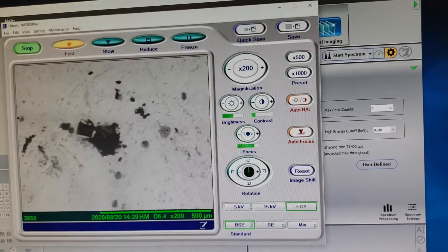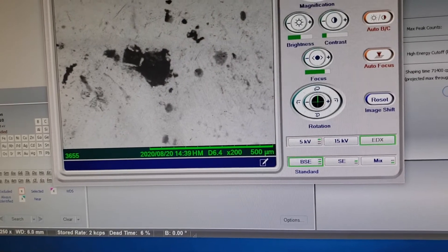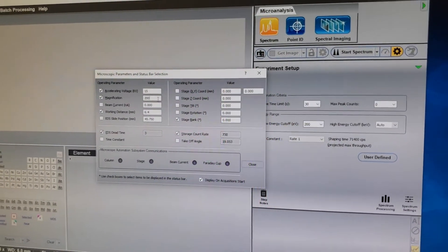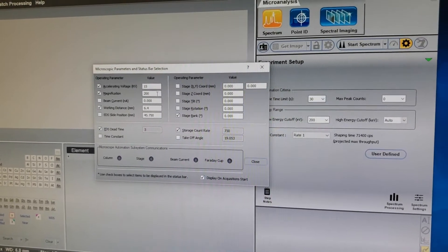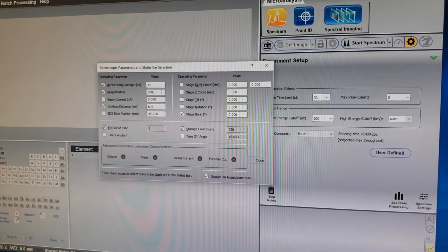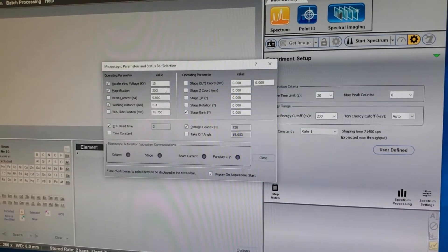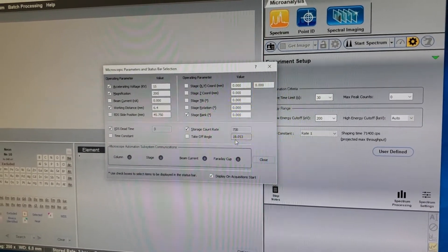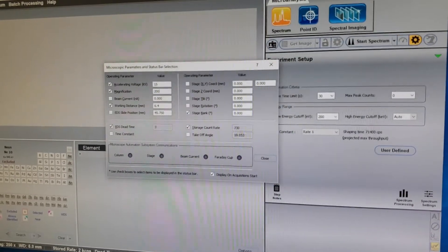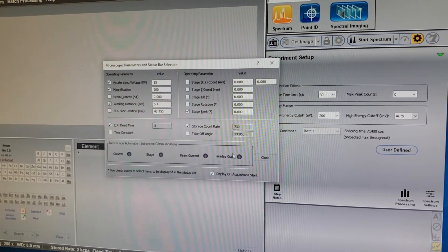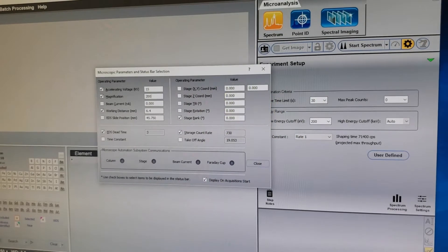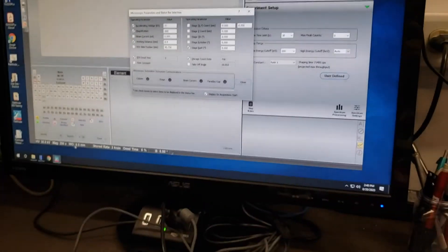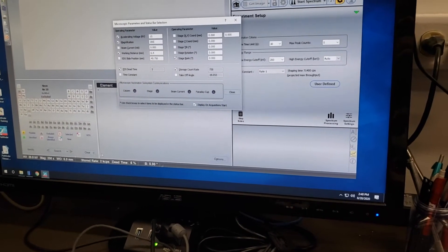Because I changed my focus, my working distance changed just a little bit. In Spectrum mode, these two things don't matter as much. In Point ID and Spectral Imaging, it's very important that those values are updated. If at any point I change those values, I can get the dialog box back by clicking anywhere along the bottom bar where it shows working distance, magnification, and accelerating voltage.